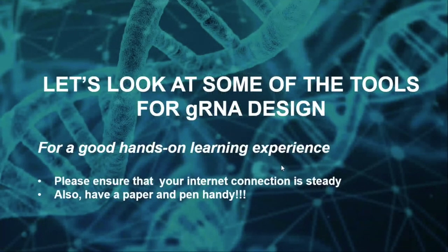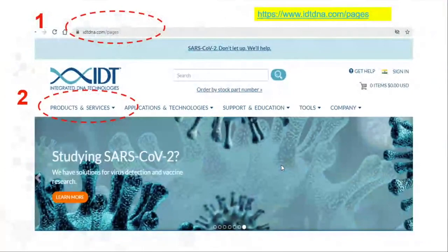Now, with this background, we'll have a look at some of the tools for guide RNA design. For a good hands-on learning experience, please ensure that your internet connection is steady and you have a paper and pen handy. Now we are going to go online and use online sources for designing your guide RNAs.